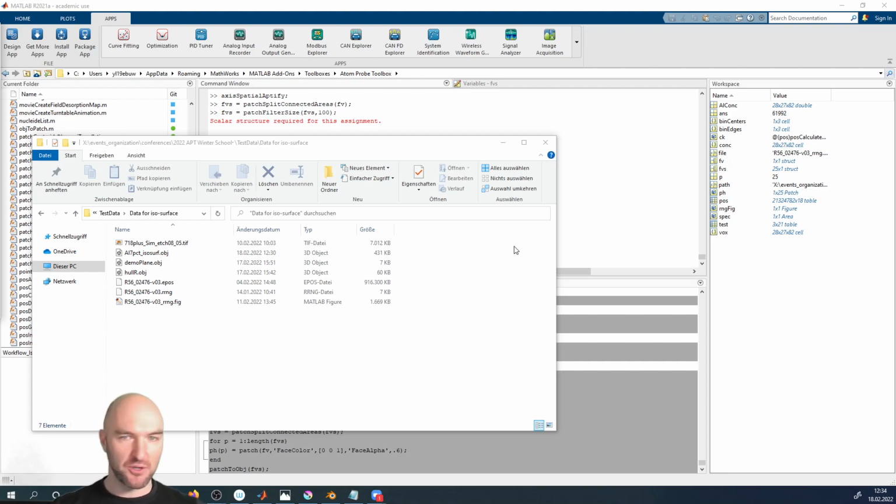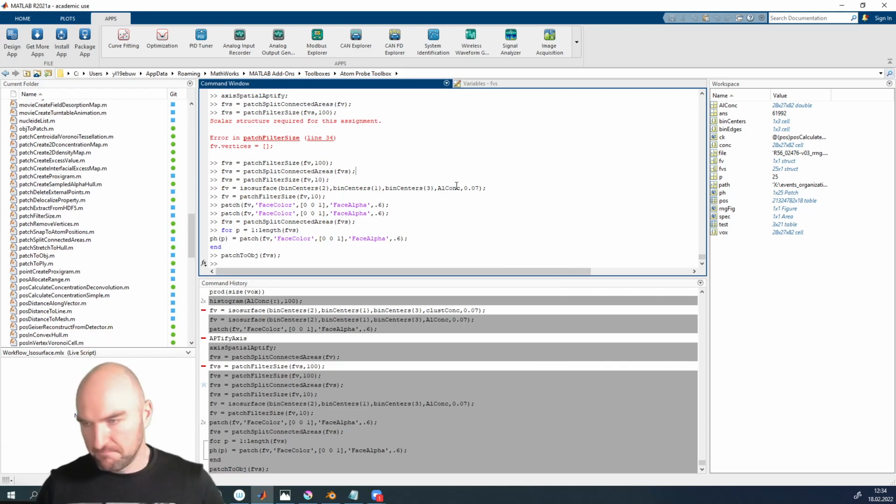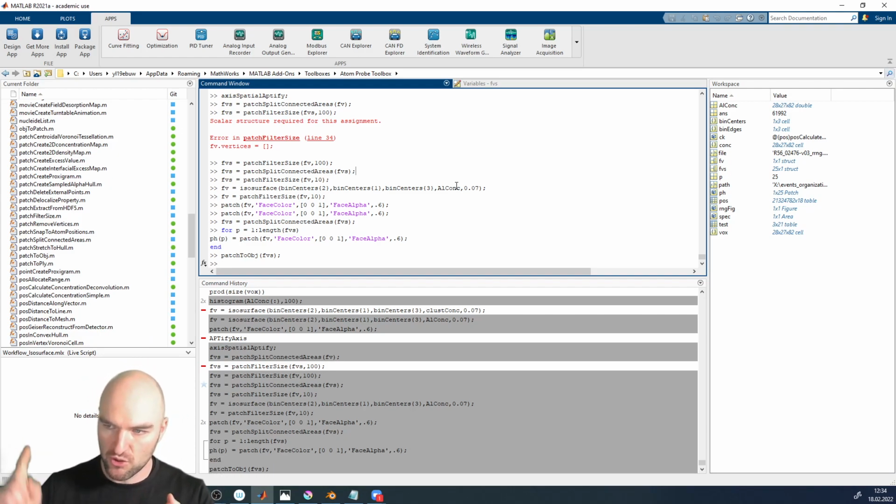Okay. Any questions about the ND analysis object creation and ND analysis generally? Essentially, it's 1D concentration plots, 2D concentration plots, voxelization, proxigrams, all thrown into one concept, because really they're all the same concept. You're voxelating based on some dimension, on some distance equivalent, on some distance function, which could be all kinds of things.